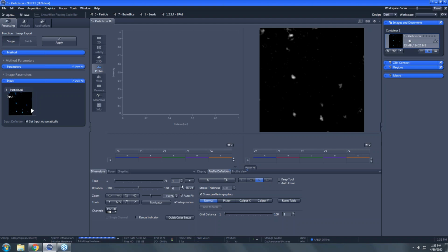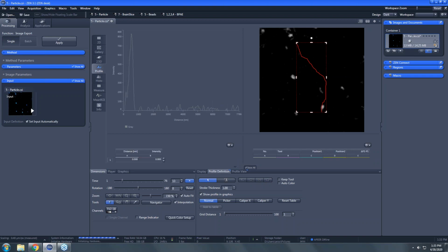Good. So as we play through this, Nicole's going to trace the path of the particle movement. We'll wait for her to... I think you're doing beautifully. Terrific. Perfect. Right click to end.